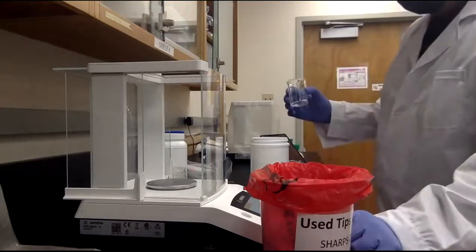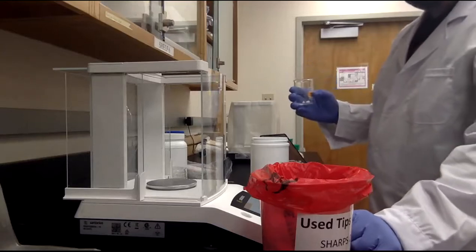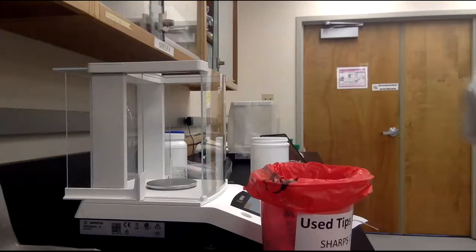See, so we've got to put water in it until you put your base or acid in it. Yes, it's right here. So just grab one set of the pipettes from the drawer, and I will bring the acid and base to you.